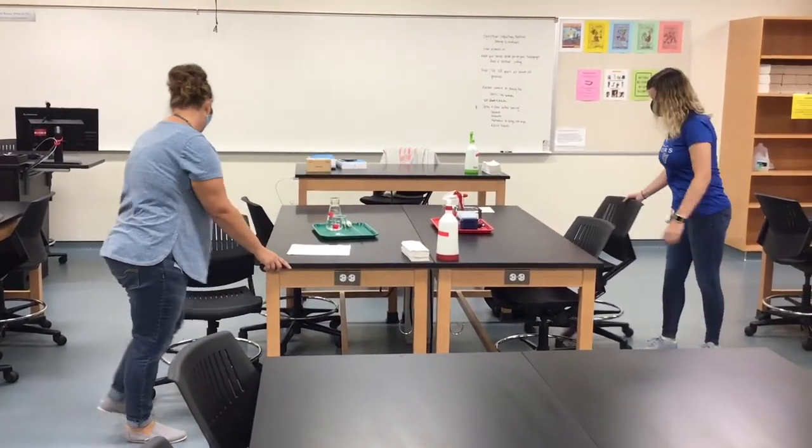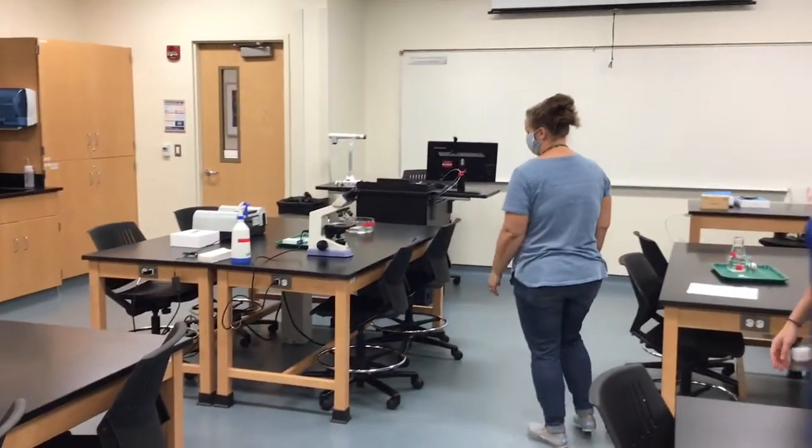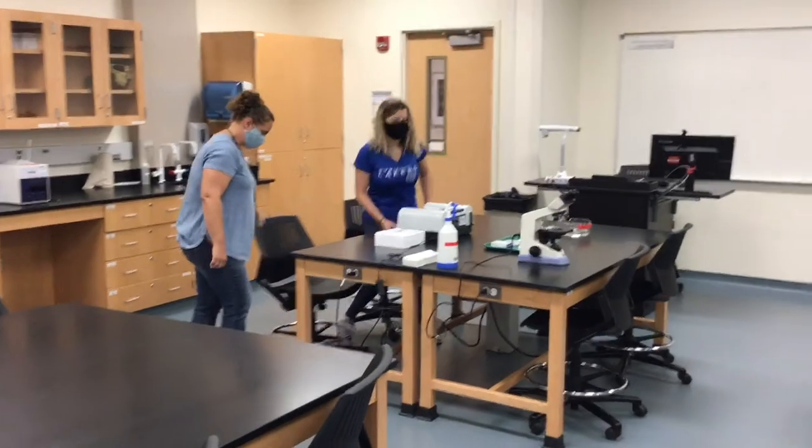There will be times in the lab where you have to get closer than six feet to work on a piece of equipment together. Make a plan before you get to the shared piece of equipment so that your time spent within each other's six-foot bubble is minimized.